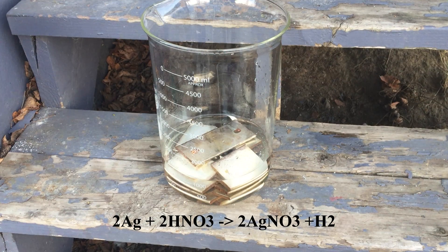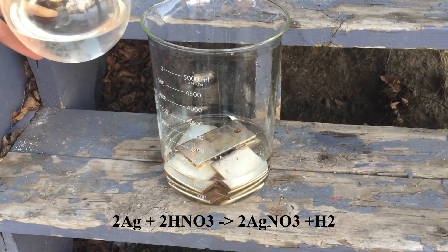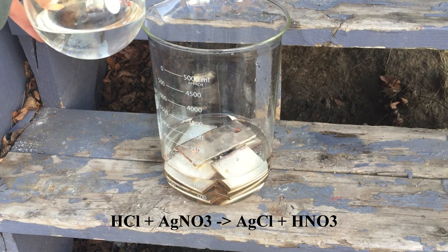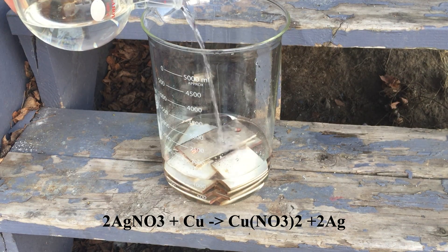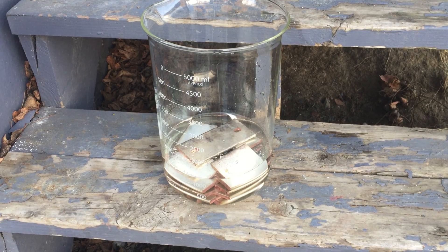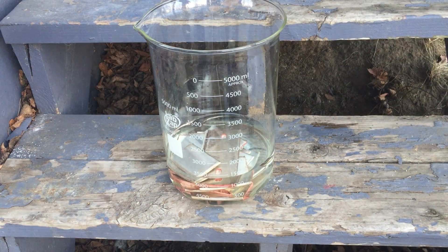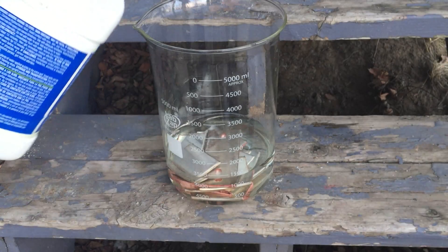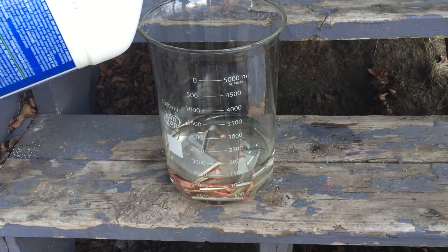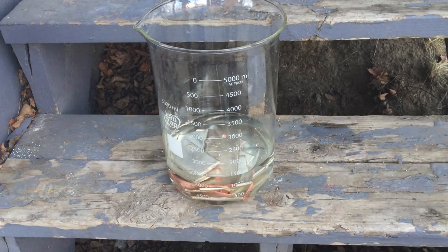The combination of both acids is important. The nitric acid will initially dissolve the silver and with the presence of hydrochloric acid it will form a silver chloride precipitate. Without hydrochloric acid the silver nitrate formed by the reaction with nitric acid would replate on the copper surfaces. So the production of silver chloride precipitate on the silver surface passivates the silver below. This allows the copper under the plating to be slowly eaten away leaving the silver to flake off.